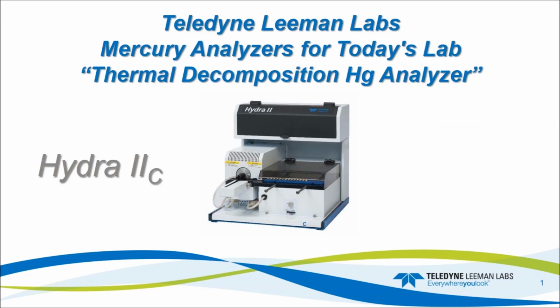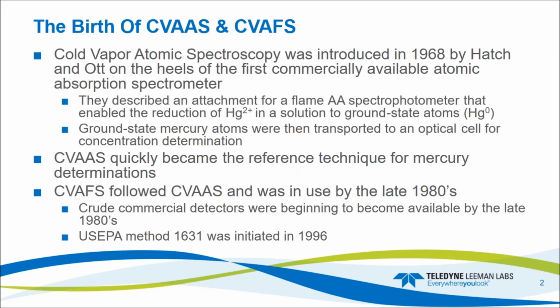Thank you for sitting in on this continuing education series regarding our mercury systems. Today, I have a short presentation that describes the theory of the Hydra II thermal decomposition mercury analyzer. It's a direct mercury system for solids, semi-solids, and aqueous samples. Let's get started.